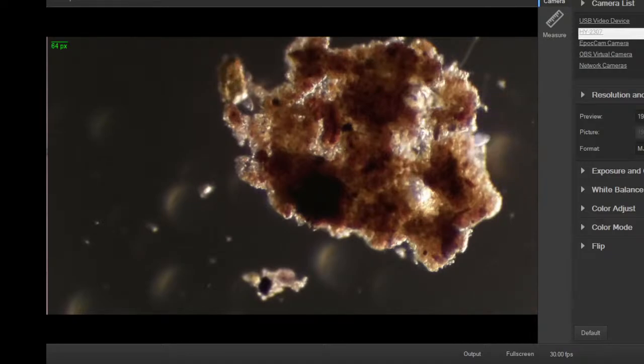So it's not smooth. The ciliates are very, like a sports car. They just come in, zoom, zoom, very directional, very purposeful. Back in, back out, turn around, flip around. And the flagellates tend to have a wobbly motion, like if you've ever seen footage of a sperm cell swimming on a slide. It's got that giant flagellum making it swim all wobbly. Still has good direction, but it can't turn very fast, and it can't do complex rolls and reverses and stuff like a ciliate can. That's why the ciliates are my favorites to watch.